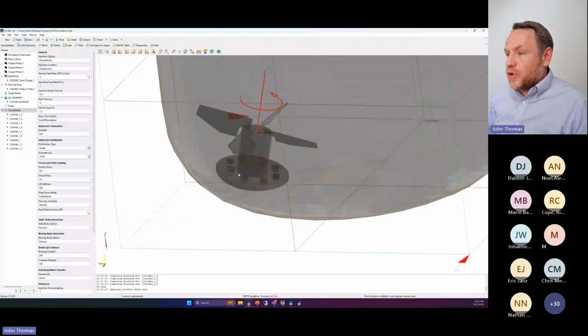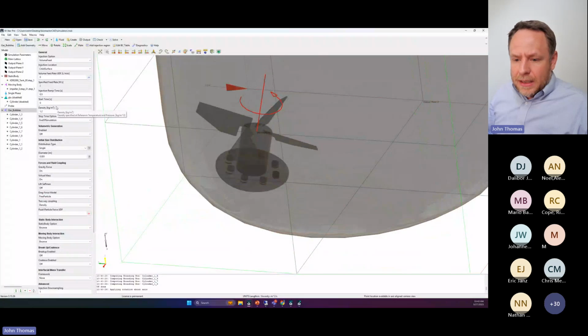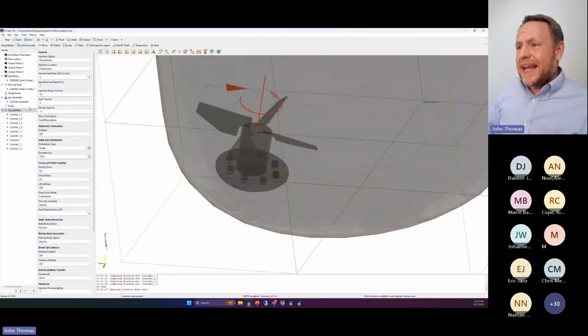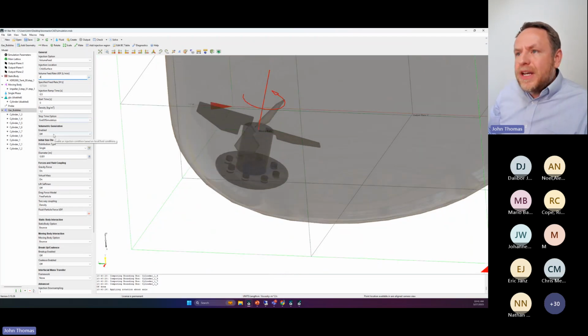So now we're going to have spargers coming in. Now, we need to specify the initial bubble size. Okay. Let's go ahead and specify this. So we can do some sort of gas flow rate. Maybe I'll specify like 4 liters per minute. That's perfectly fine for the system. I can use what they did in the GE Accelerex engineering note. For initial bubble size, I'll have it come in at time 0.